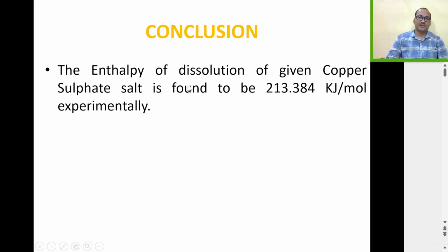So in conclusion, the enthalpy of dissolution of the given copper sulfate salt is found to be 213.384 kilojoule per mole experimentally when we take only 25 ml of water.